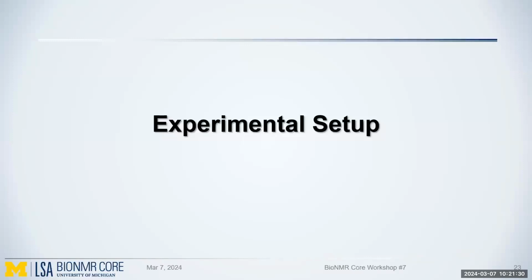All right, if there's no more question about this STD-NMR sample preparation, then we'll move on to how to set up the STD-NMR experiment manually on TopSpin.